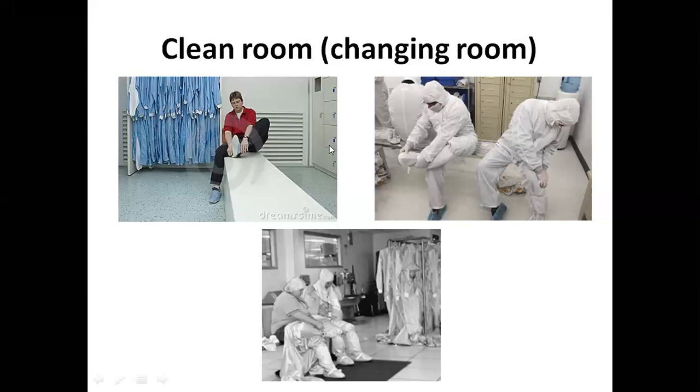On the dirty side, each user would have their own shelf where they could put their shoes or shoe covers. So first you have to put the shoe covers and come to this side. And then you have to put the coveralls and all other things.